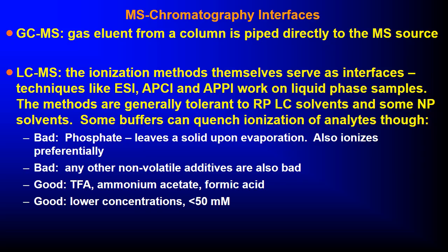When we have liquid chromatography mass spectrometry, the ionization methods themselves serve as interfaces. Techniques like ESI, APCI, and APPI work on liquid phase samples. The methods are generally tolerant to reverse phase liquid chromatography solvents and some non-polar solvents. Some buffers can quench ionization of analytes though.